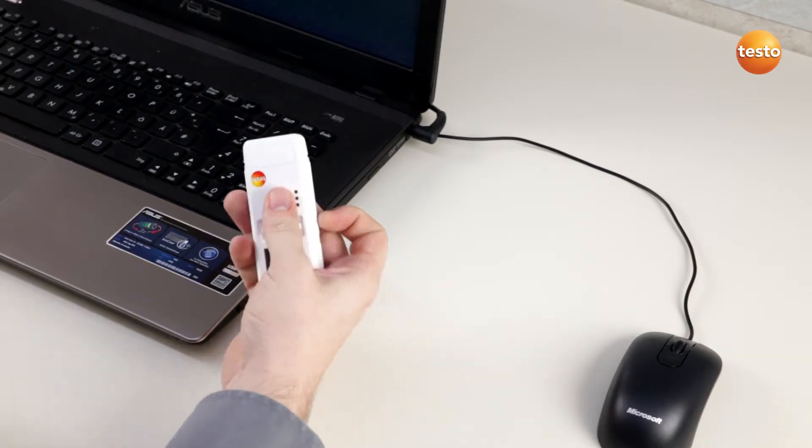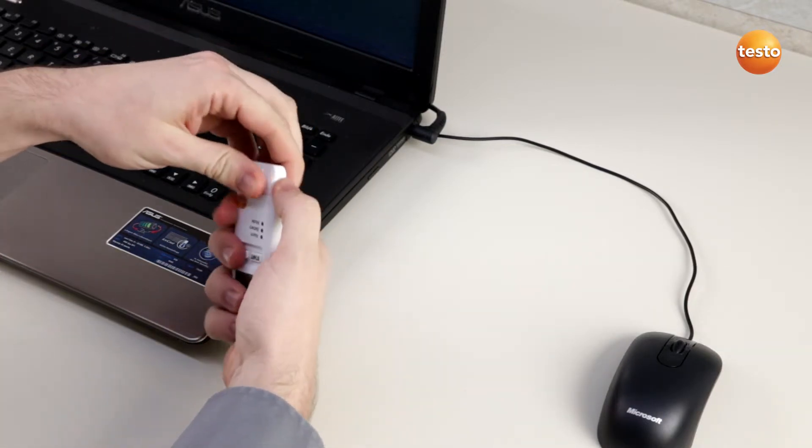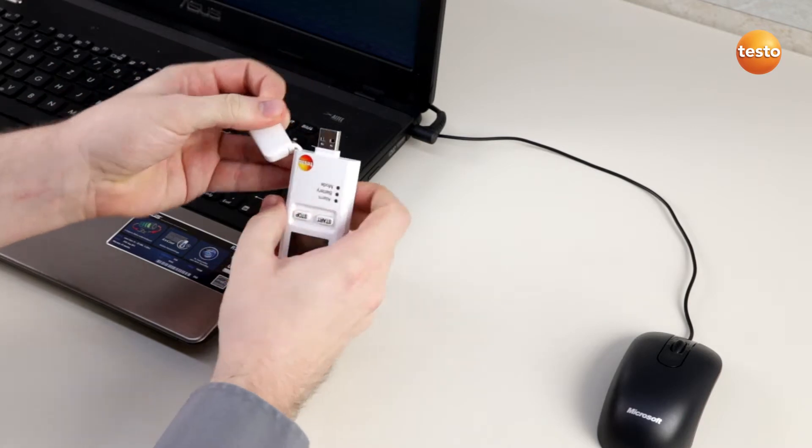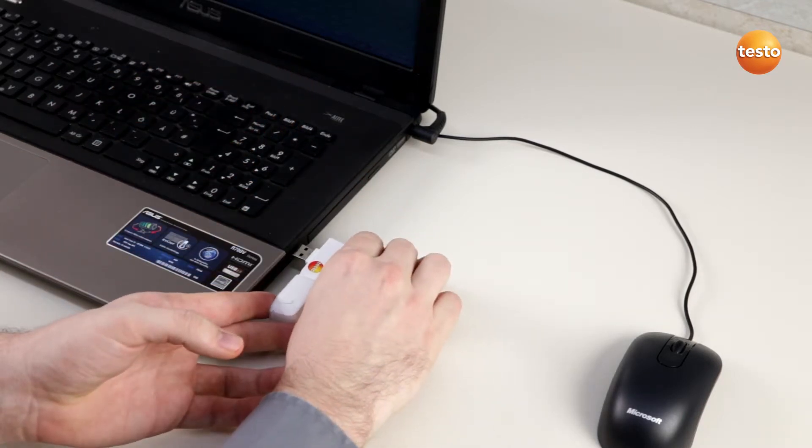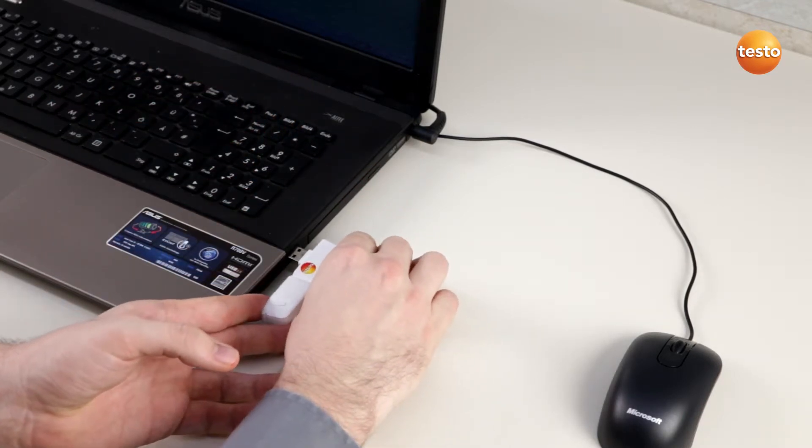Therefore, we simply take off the USB cap of our data logger and plug it into the USB slot of our computer.